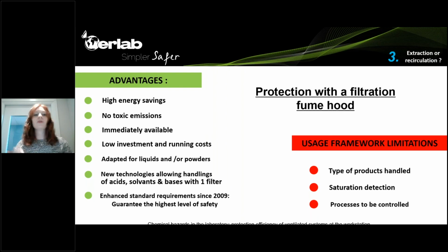They are adapted for liquids and powders, and they have enhanced standard requirements since 2009, which guarantee the highest level of safety. For the limitations, as I said previously, there are different types of products handled that are not trapped by the activated carbon filters, and there's a need for saturation detection.